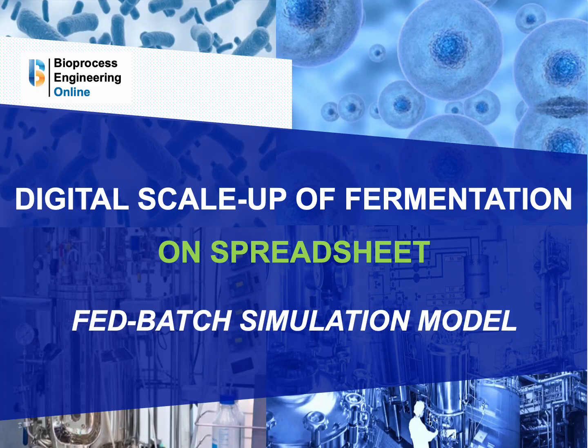Welcome to this new online tutorial in bioprocess engineering, digital scale-up of microbial fermentation on spreadsheet. In this tutorial, we focus on scaling up the fed batch operation mode, starting with the simulation of fed batch fermentation.